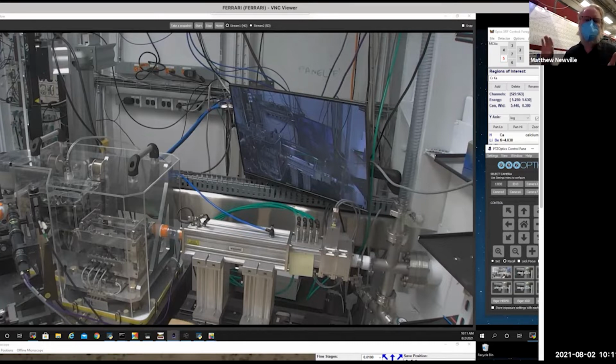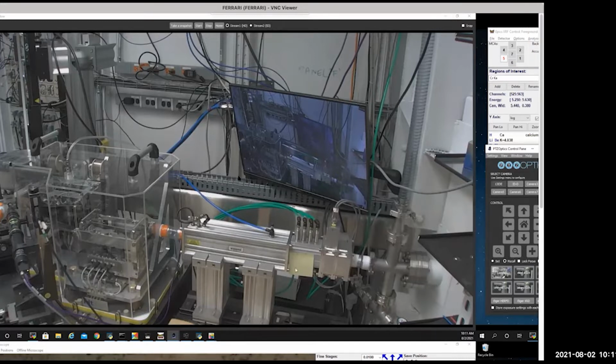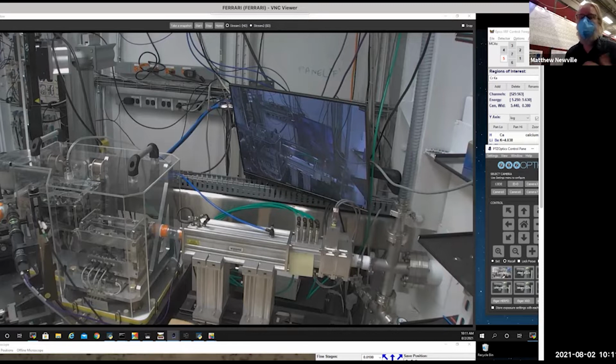We already have a monochromator and some mirrors upstream to select the energy we want, and to deflect the beam and to do a little bit of rejection of higher order harmonics, which I think is in Steve's presentations as well. Then we have some filters that we can drop in the beam. We won't be using those today, but one of those is a piece of lead, we call it a shutter, that we can use to turn the x-rays off from hitting the sample without going into the station.